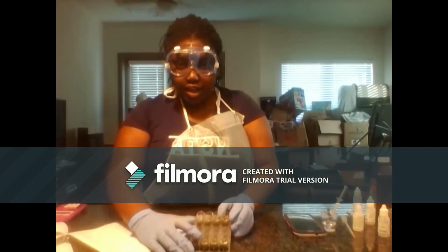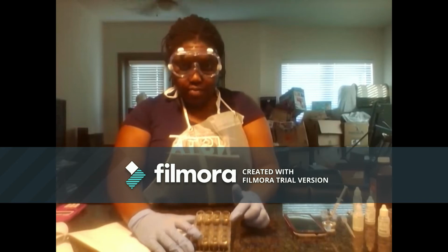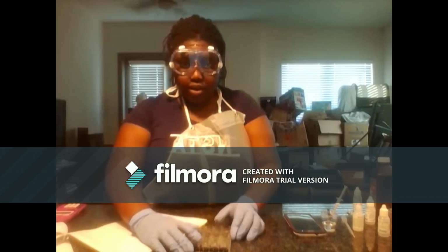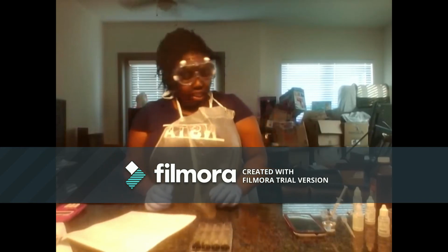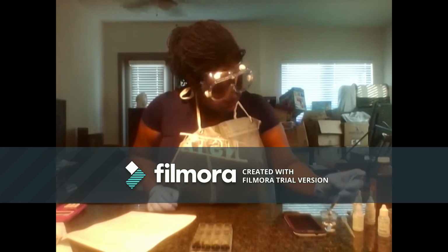Alright, so I'm back. I've done my trial 3 two separate times and my trial 4 two separate times. And so now I'm going to start my trials 5 and 6, and they need 0.2 mLs of hydrogen peroxide each. So I'll add my hydrogen peroxide and start my timer, and then I'll complete two trials.